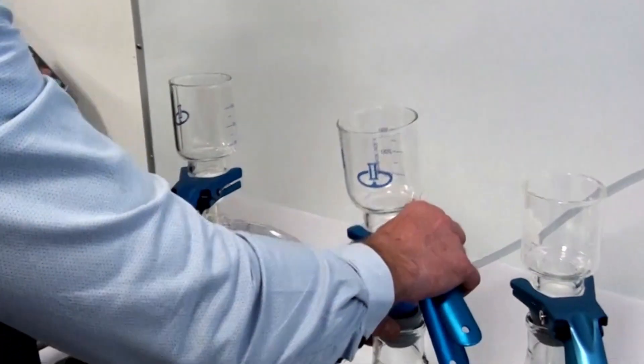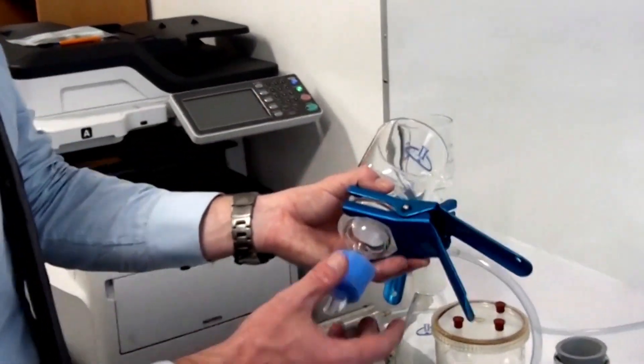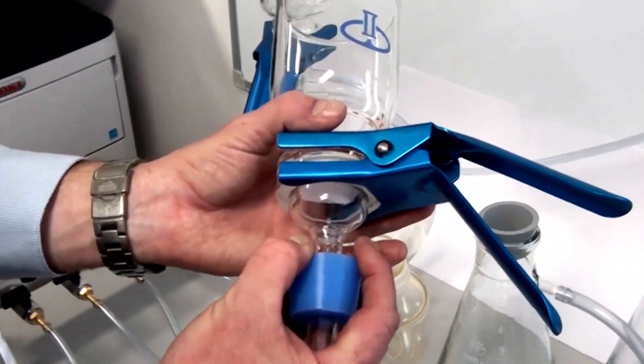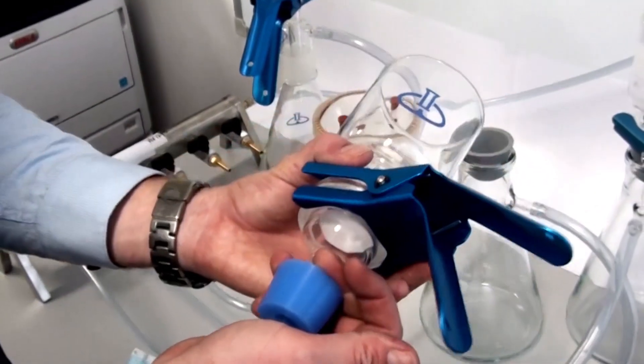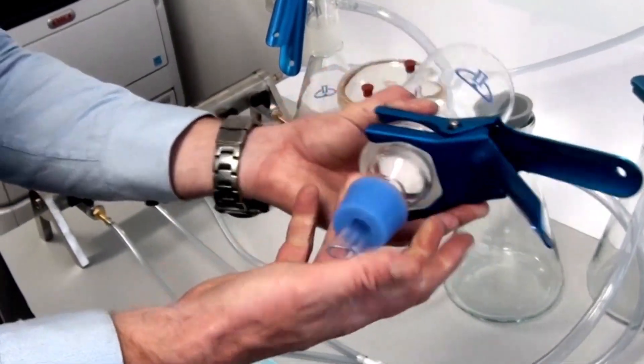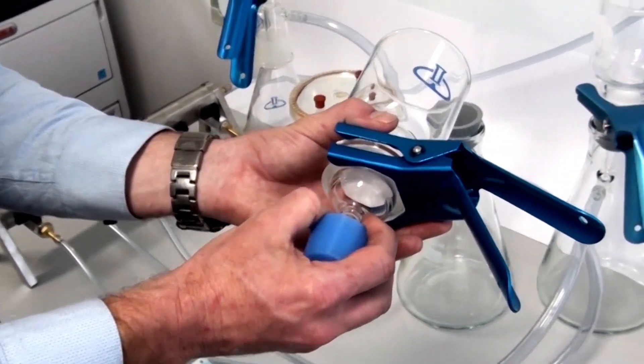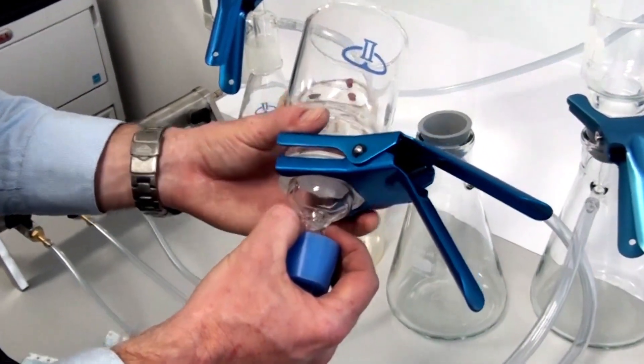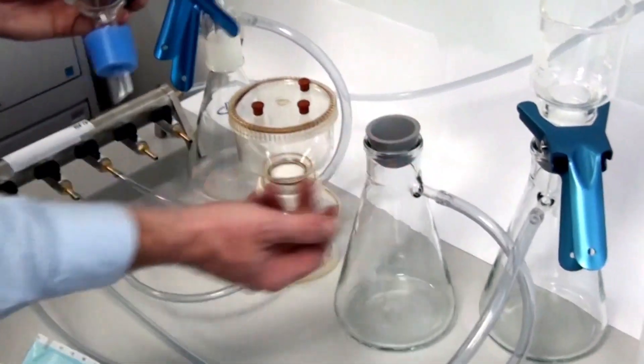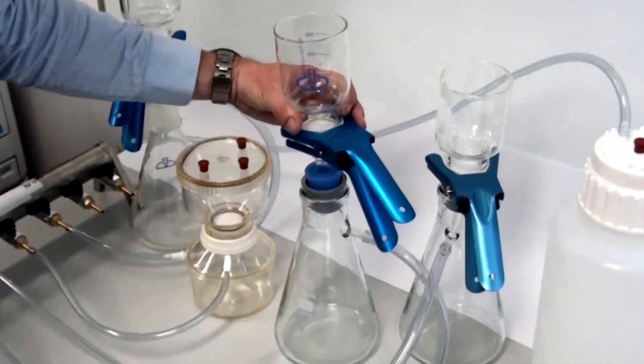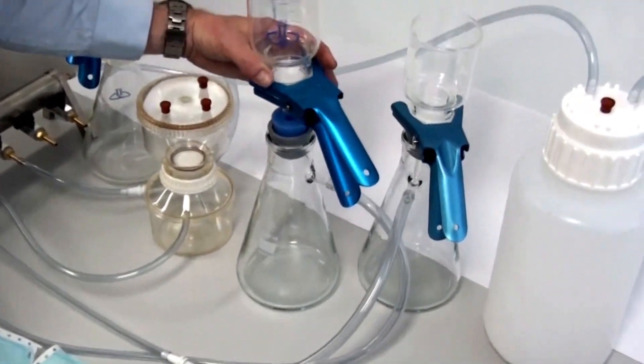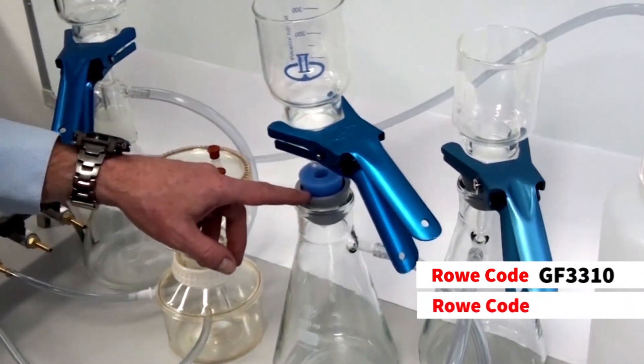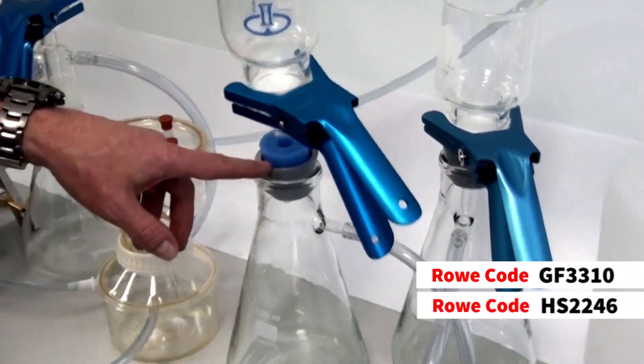Now, this isn't ideal. This stopper number eight, a size eight stopper, I've tried getting that off. Phil, do you know if these come off? It'll fit into a 500ml filter flask, but not a 1L. Right, okay. So most people set up with a Gooch? Yeah, it's like a 1L you use a Gooch. Yeah, okay. So the flask is GF3310, and the Gooch rubber I've got on there is an HS2246.